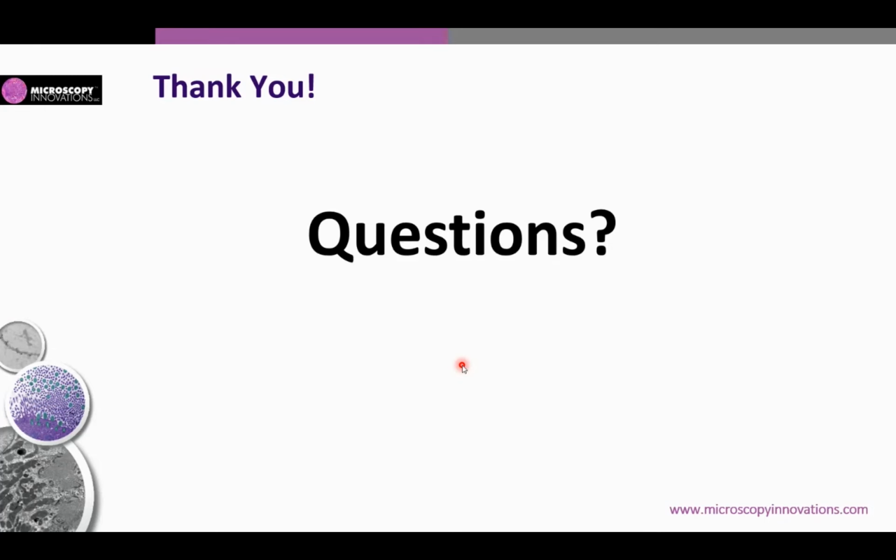We have a couple of questions that have come in. Let me begin with a comment that several people made about what they hope to gain from this webinar. About half the people who signed up said they were seeking information specific to processing in BSL-3 for biocontainment. And Candace, I think that was addressed extremely well.